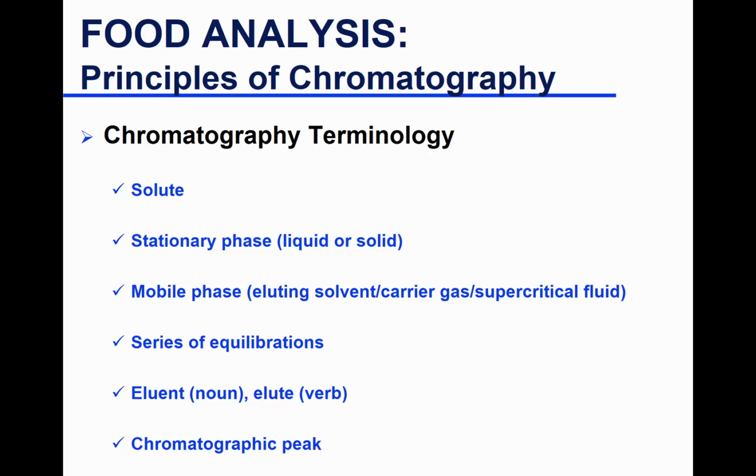So you get a peak. Usually you don't see dots, you see a connected line. So if we have a column where your sample is loaded on the column, let's say the pigments that Svet separated, they start as a singular band, and as you add solvent, you start seeing them separating, and the separation becomes greater.